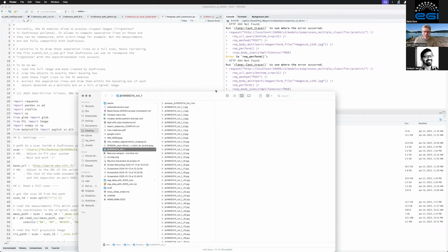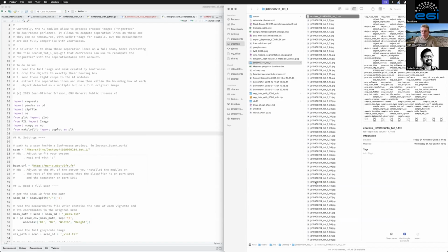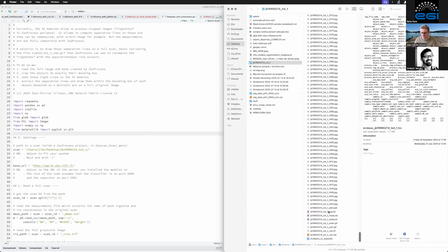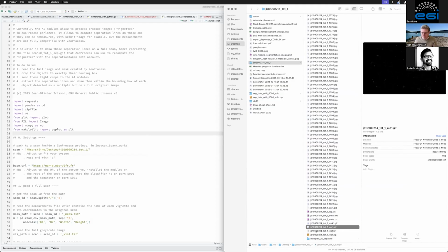this is a scan from ZooProcess, okay? So this is what you find in ZooProcess scan and then _work, okay? So this is one scan. You get your ecotaxa.tsv file, all the JPEG images, I mean the vignettes basically, and then at the end you have a log, measurements, a mask, and the actual image, etc. In there, you can have a file that's called blah blah blah _sep.